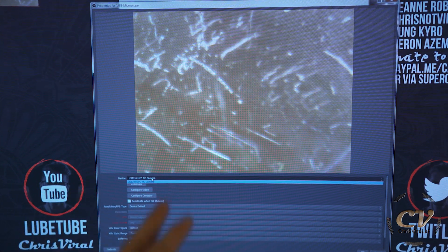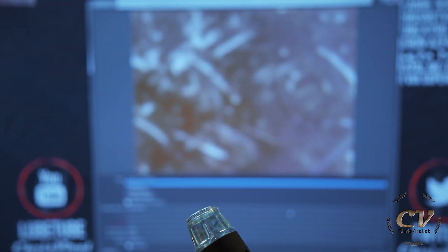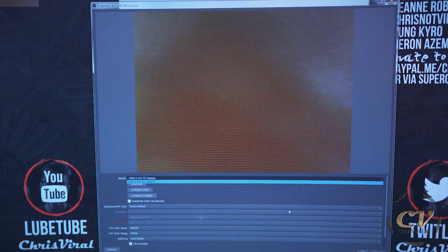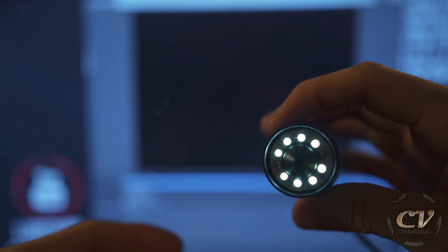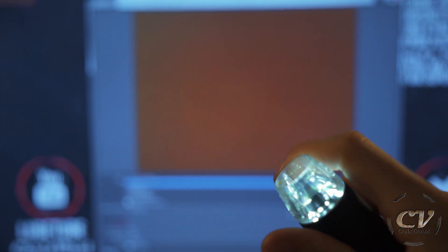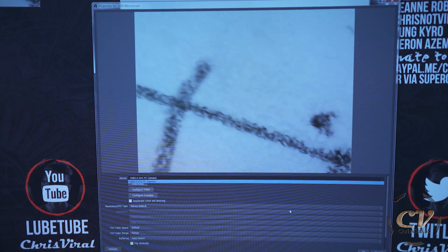I'm currently focused on this glass. As I turn this wheel it will adjust the focus. The other magnification levels do make sense, because this is probably a really high magnification. So let's remove this little safety cap right here — I actually removed everything. Whoa! No way — this is a piece of paper!